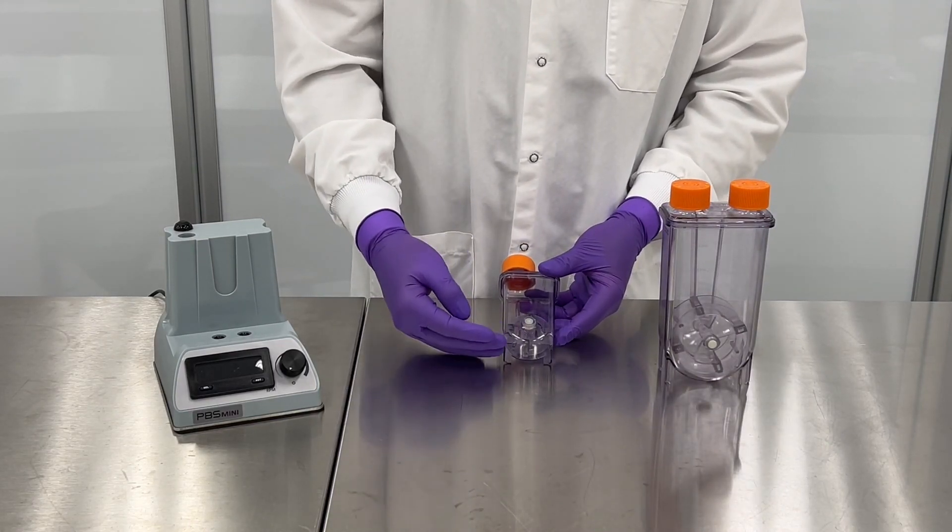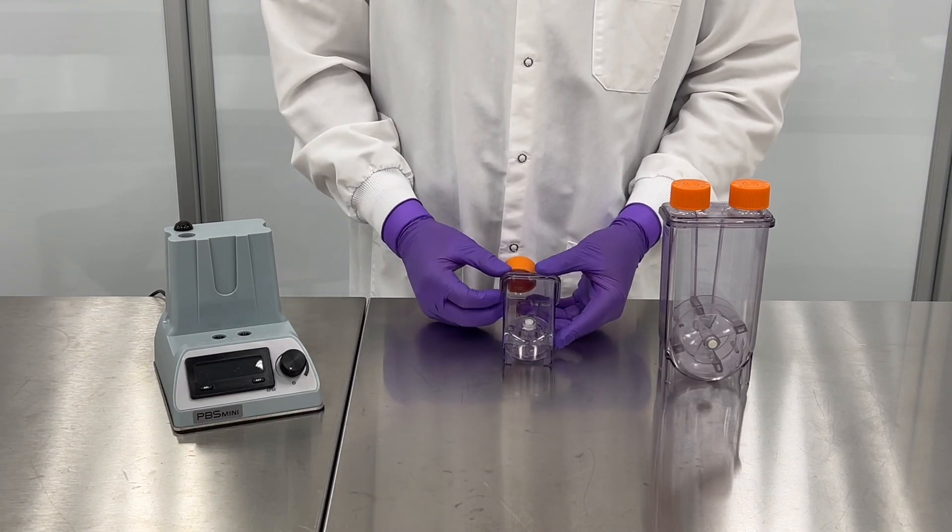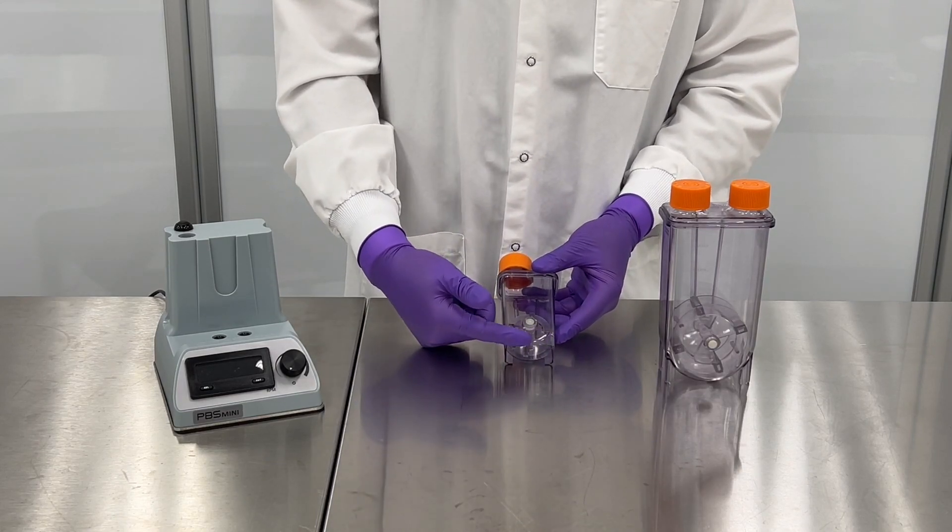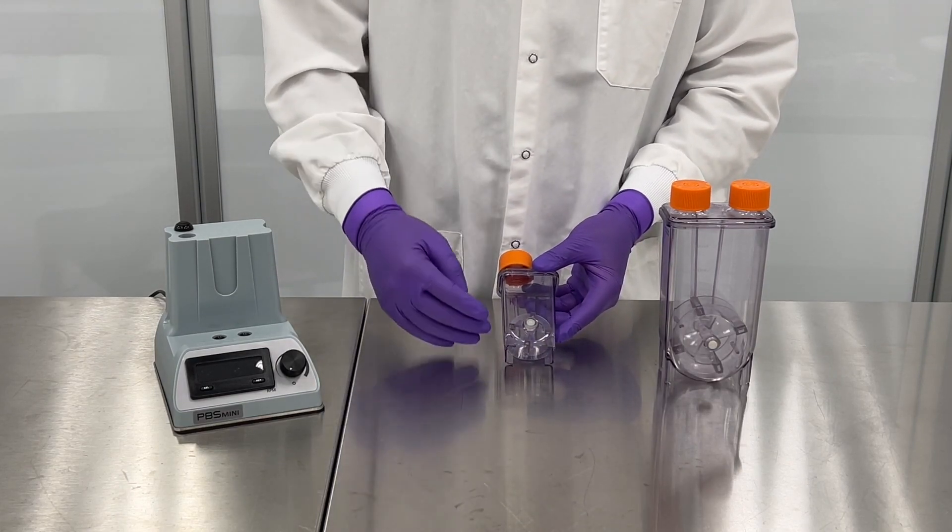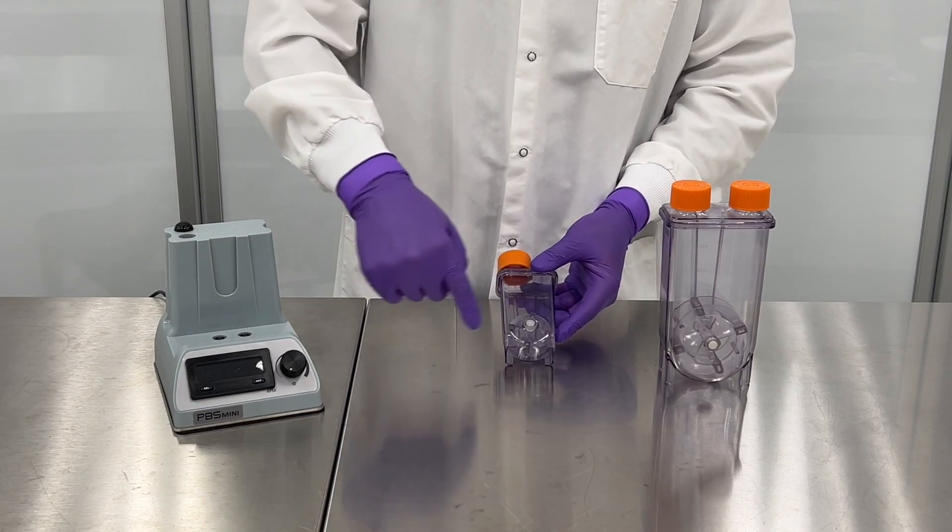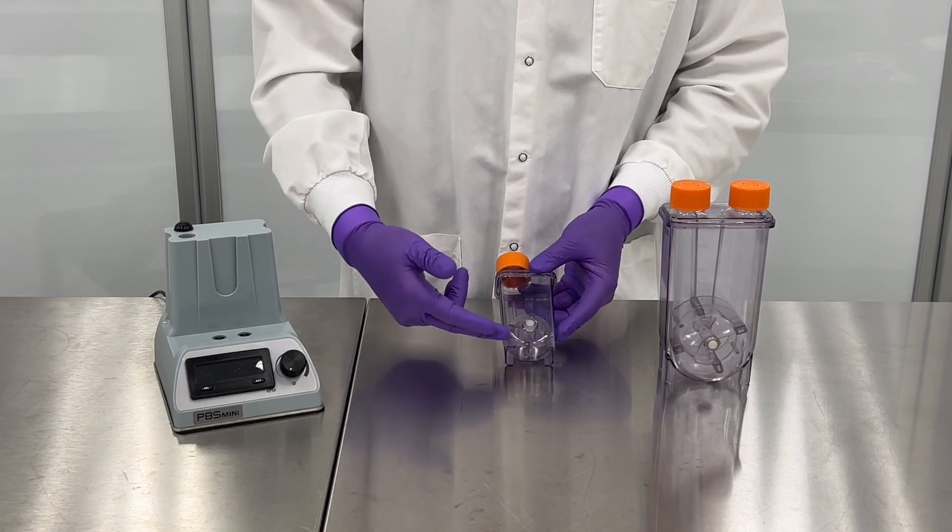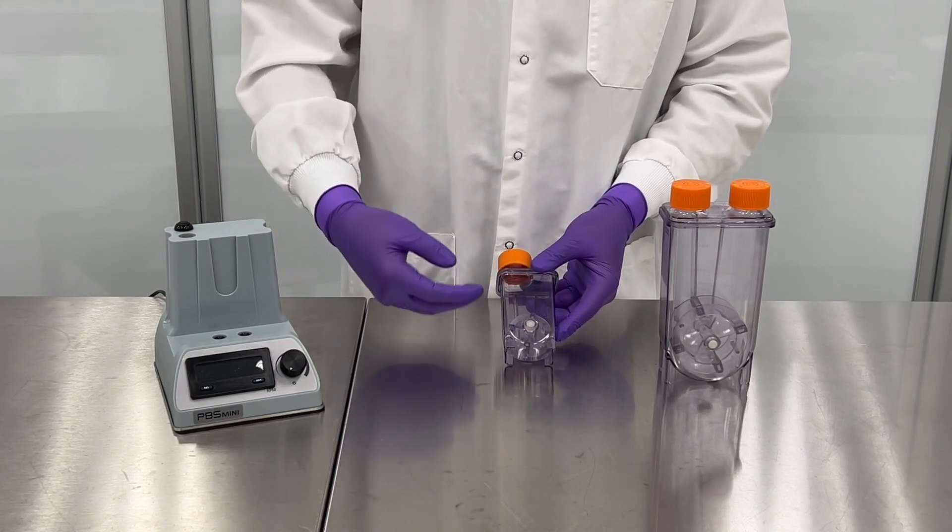Starting from the bottom here we have four feet so that actually helps it stand up. We have our u-shaped bottom that is coupled with our vertical wheel impeller so as that spins we have a nice laminar flow on the bottom which allows for our overall gentle mixing.